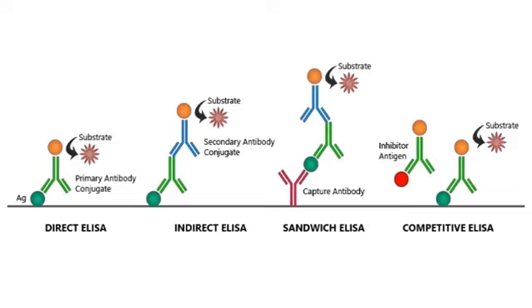Then we add the primary antibody, which is not enzyme linked, and then we add the secondary antibody conjugate that is enzyme linked, اللي هو الهورس radish peroxidase, for example. And then when we add the substrate, and if the color develops, that color will be detected again by the plate reader.